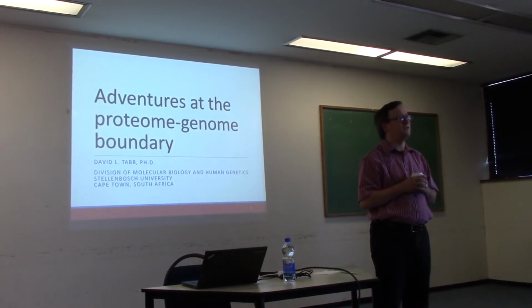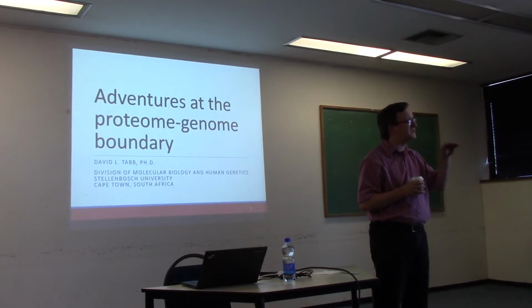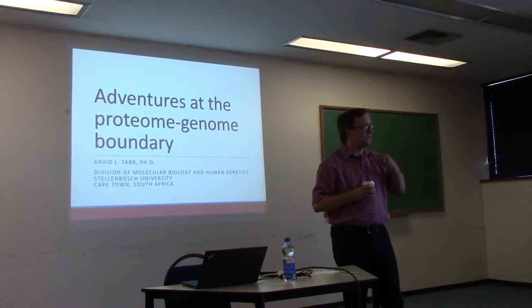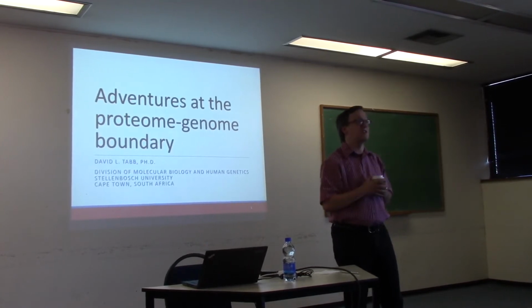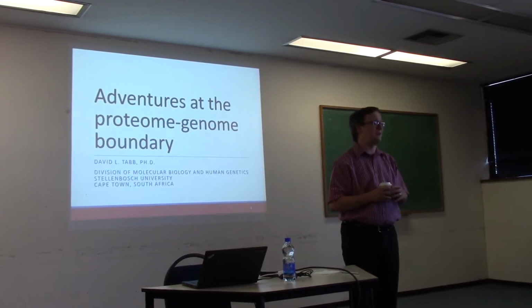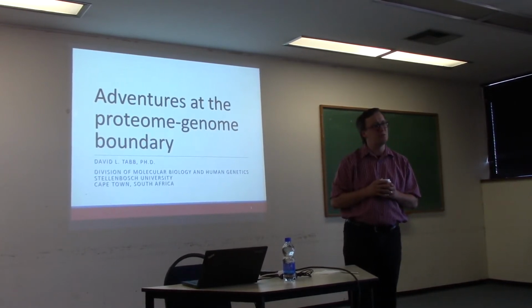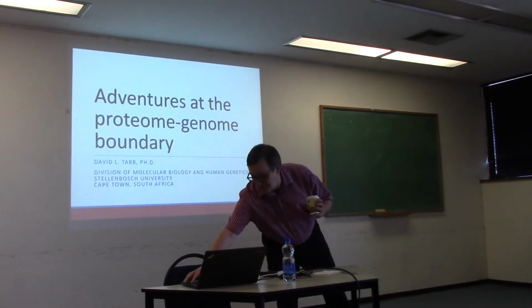I was asked what I am doing as a basis for how to frame my talk today, and I thought that it would be best to talk about a set of projects that all fall on this boundary between genomics and proteomics. I spent a lot of time thinking about just proteomic identification. That's really the field that brought my career to a boil, creating the algorithms that let us identify proteins and identify peptides and post-translational modifications from tandem mass spectrometry data. And that's a place I'd love to talk for a long, long time about. But today, we're going to change gears a little bit and talk about this touching the world of genomics. How do we draw information from genomics into proteomics? And what can we do in proteomics without genomics having been done? So it should be a lot of fun.